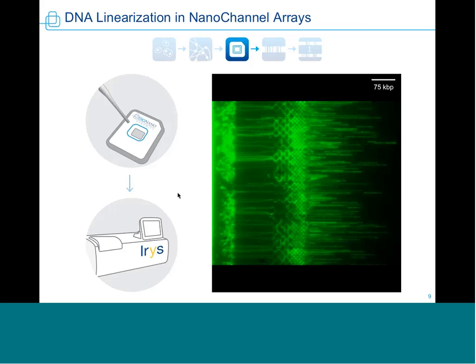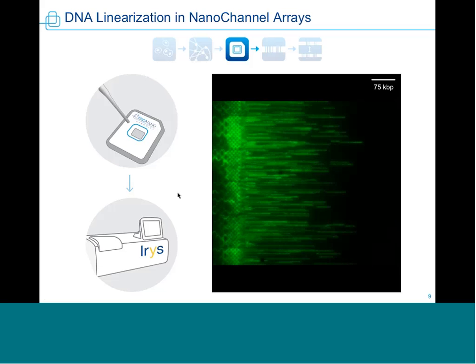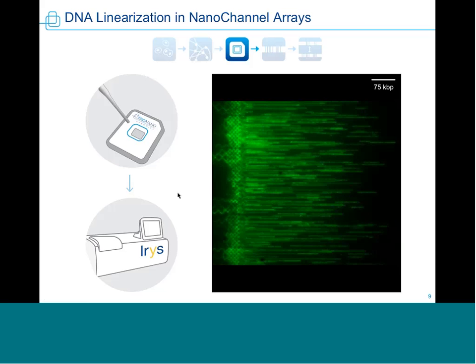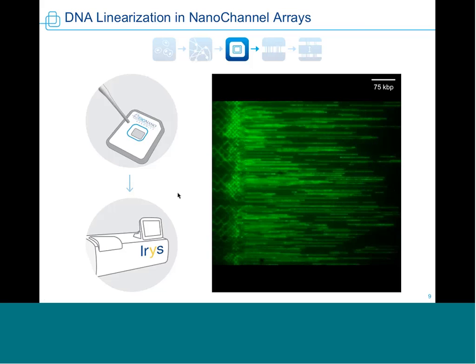And for the rest of this presentation, you'll see these types of structures here at the bottom. This is really how we visualize a genome map, with the vertical bars being, again, where the nick sites are. And so the end result here is that you can do your science with these genome maps. Whether you're scaffolding or you're doing structural variation, here I show a comparison between our blue genome map with the reference sequence.